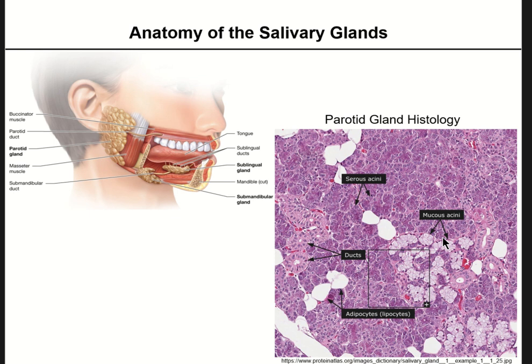So remember with goblet cells, how they produce mucus to help with lubrication. And we saw that a lot of times when we look at epithelial cells, goblet cells also stain a little lighter, right? So mucus cells are going to stain a little bit lighter, as you can see here, and the secretions that they produce will help keep the mucosa moist, and so they're pretty much released continually.